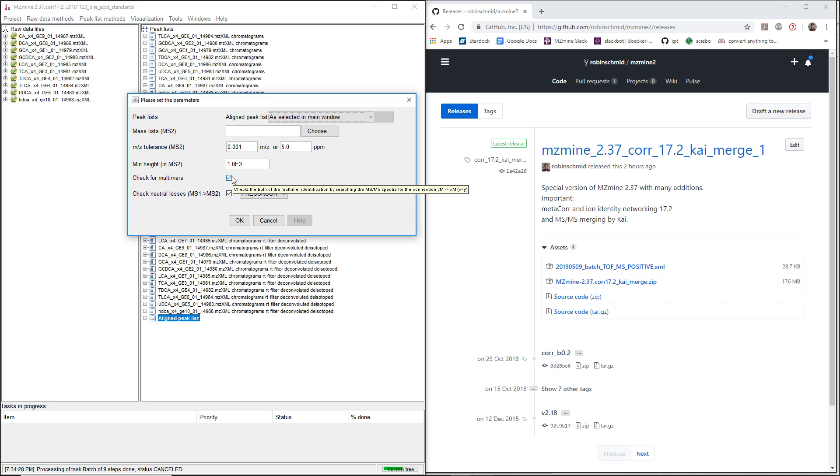We just lose the molecule that was creating these clusters, and we can verify this automatically in MSMS.